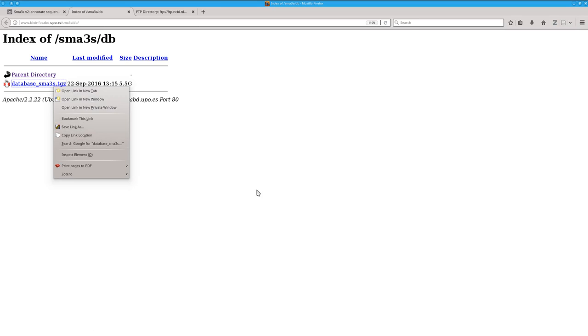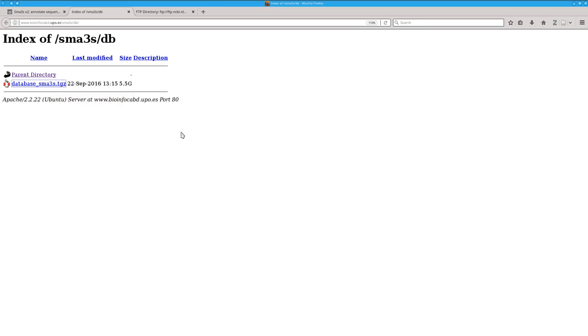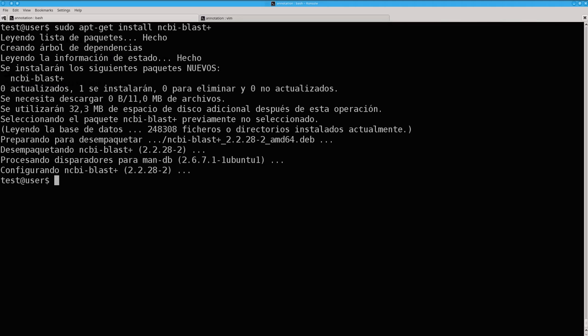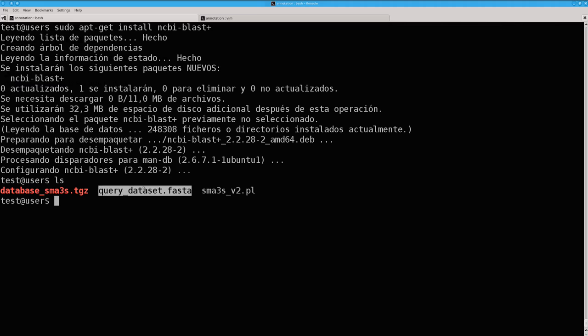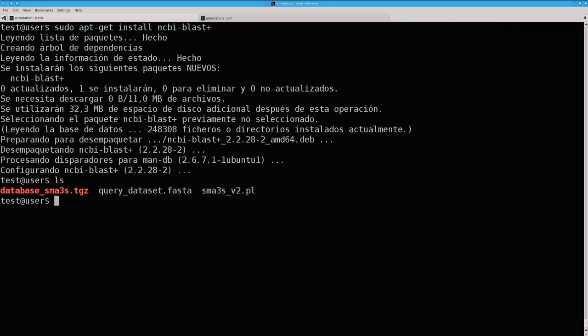Well, at this moment we will have in the same folder the query dataset to annotate, the reference database, and the program.